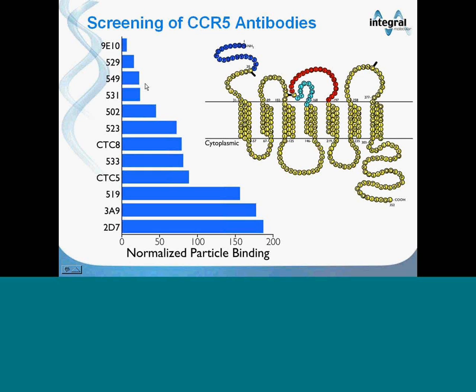Every biosensor experiment ends with regeneration of the chip because ultimately you want to be able to use your chip surface more than once. So we do regenerate these chips, and when we do these experiments in the capture format, we regenerate down to the original capture surface. So we either regenerate down to the lectin, the wheat germ agglutinin, or we regenerate down to the capture antibody, just depending on what we have immobilized on the flow channels.